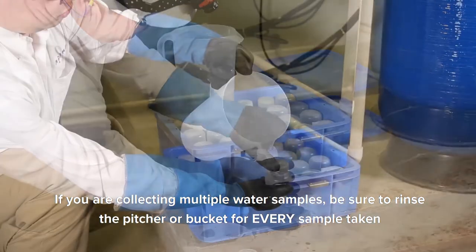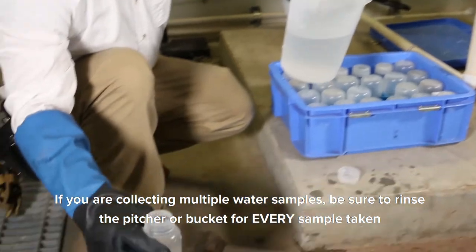Make sure to fill the sample bottle all the way to the top leaving no room for air. If you are collecting multiple water samples, be sure to rinse the pitcher or bucket for every sample taken.